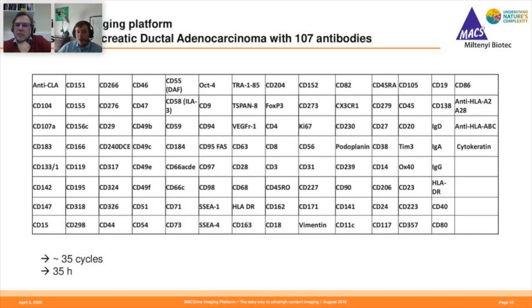How many color channels can you image simultaneously, was asked. So it's a standard epifluorescence microscope, so you're limited to that. I mean, you've got 6 LEDs and 6 sets of filters in there. So potentially 3 or 4, but again, that's running into more standard problems with normal optical epifluorescence microscopy, and it's designed so that you can just do one color at a time, but 4 colors within each cycle is how we predict it's going to be used mostly.